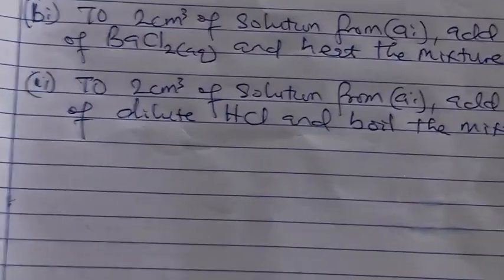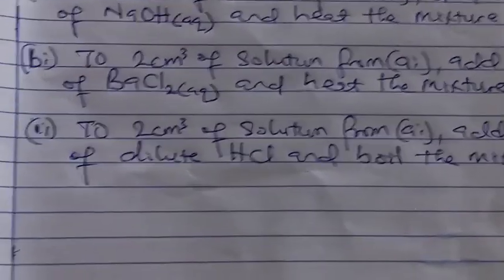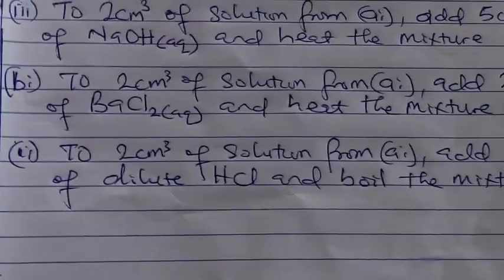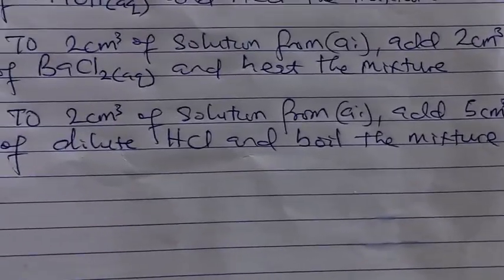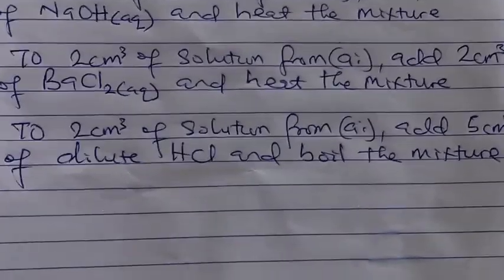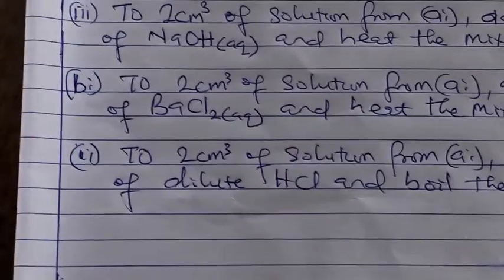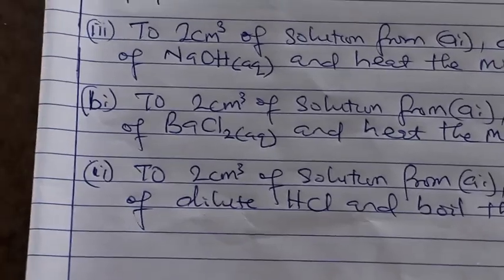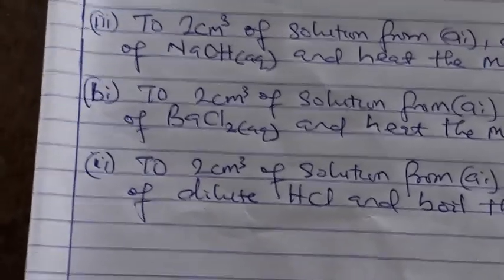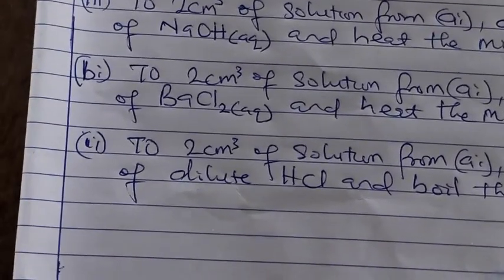What we did not do, remember to add. We're going to make some correction for that BI. That BI, before we heated, we added what? HCl, am I right? We added HCl to BI before we heated. Did we add HCl? Yes. We added HCl before heating the mixture in BI. So we're going to make some correction on question BI. Before the heat, HCl was added, please.